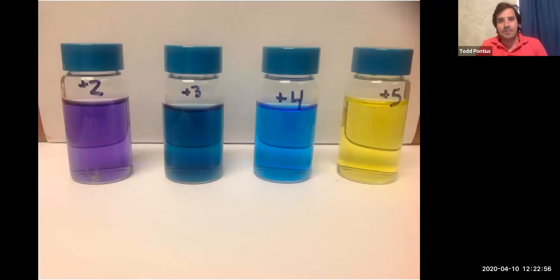This is vanadium, a metal, and what's written on each of the vials is the oxidation state it's in. Vanadium in a +2 oxidation state has this purple color, +3 is more of a kind of aquamarine, +4 it's blue, +5 it's yellow. Just a take-home point: the oxidation state of something will affect its properties.